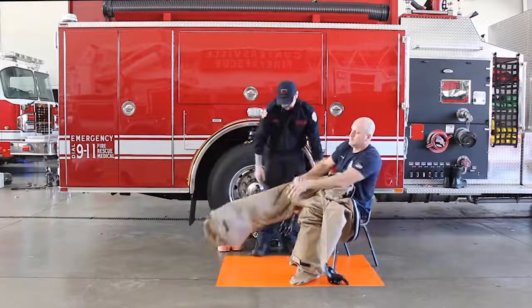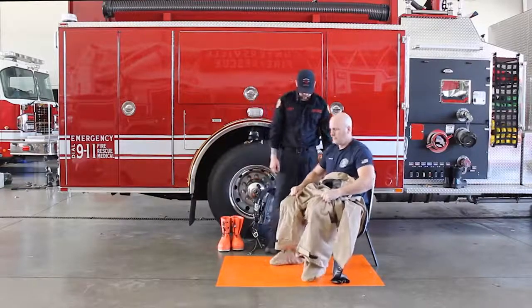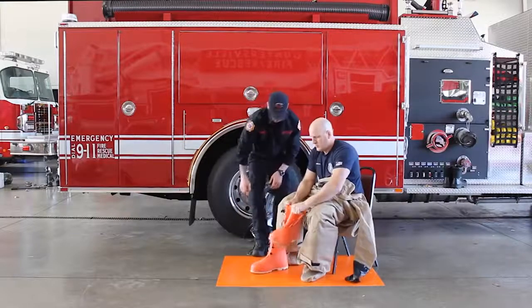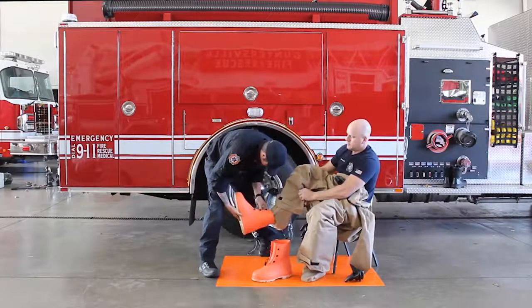Leave the fabric of the garment slack at the sock boots. Pull boot splash flaps up and don outer boots.